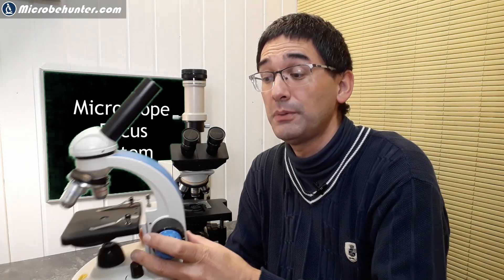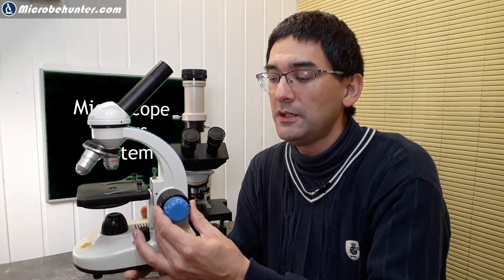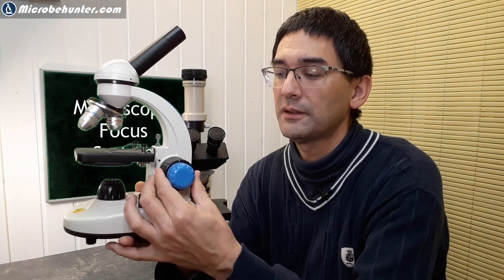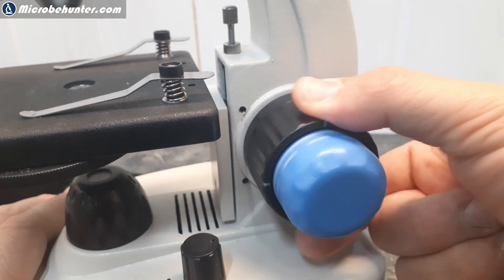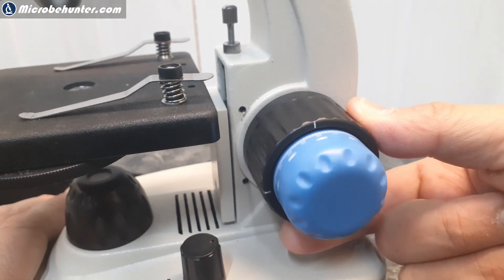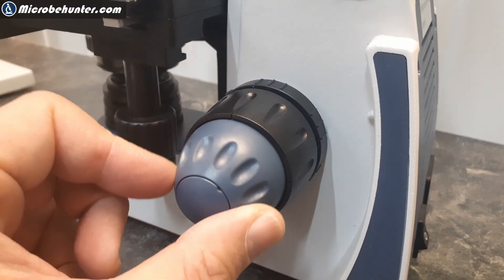That's not the only thing I want to talk about in this video — there are also different approaches to the focusing system. For example, you can see that when I rotate the coarse focus knob, the fine focus knob also rotates. This is one way the focusing system can be designed. Conversely, when I rotate the fine focus, the coarse focus also rotates. There are also other microscopes where these two systems are decoupled.